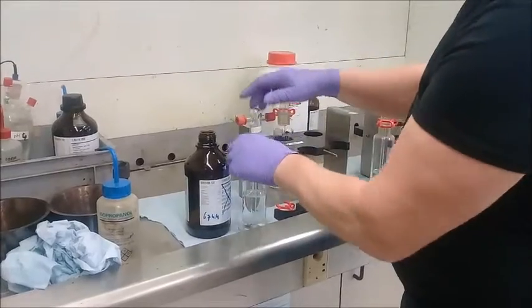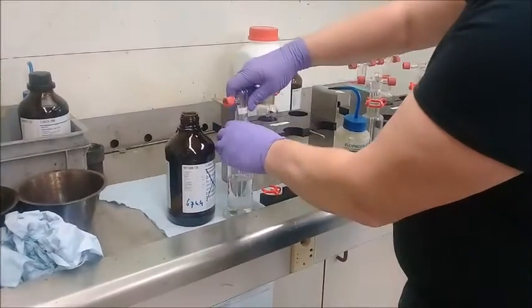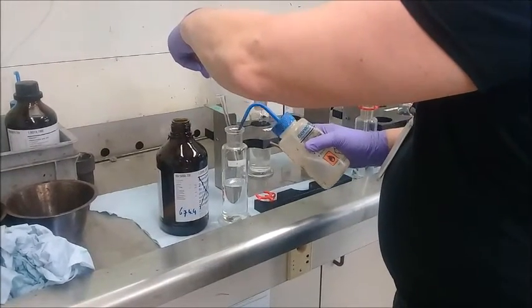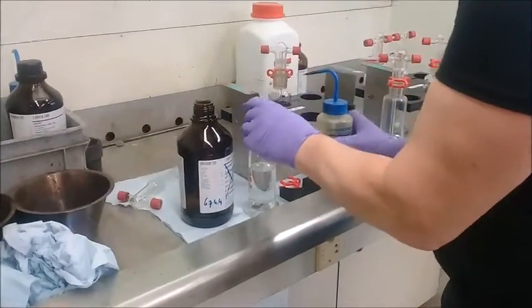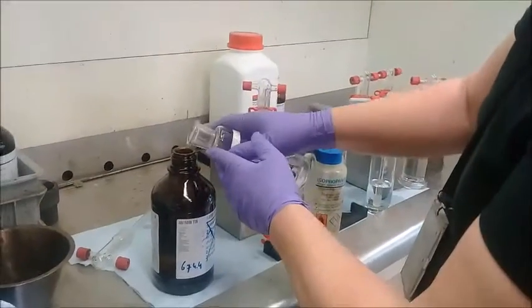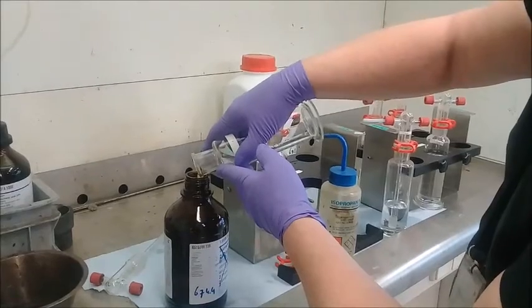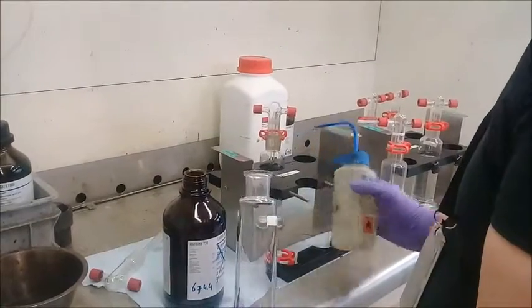So we have here the washing bottle, which we need to rinse with also isopropanol, of course. So we've rinsed the inside and we rinse the outside. Shake it a little bit. And then we just pour it into the glass bottle. There you go. Taking some extra isopropanol.